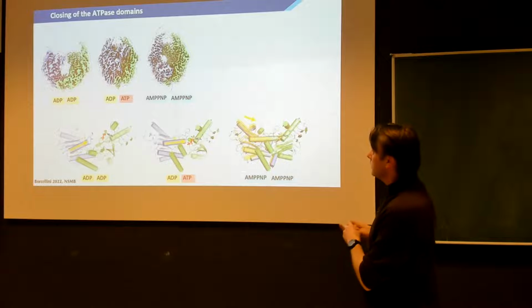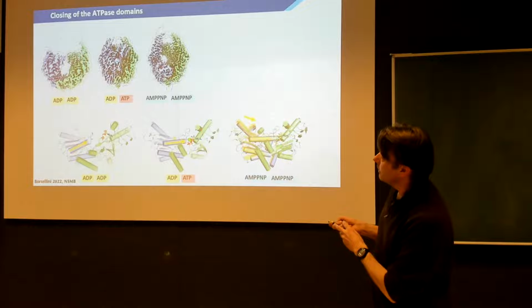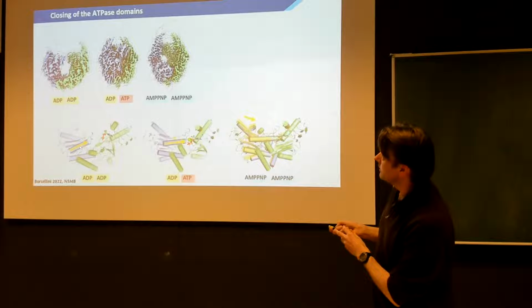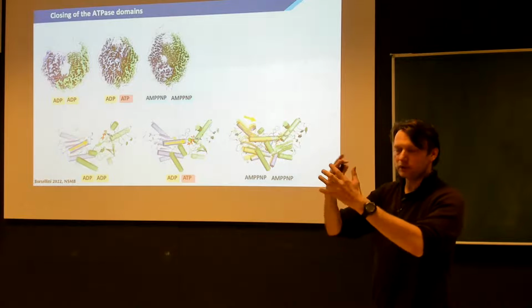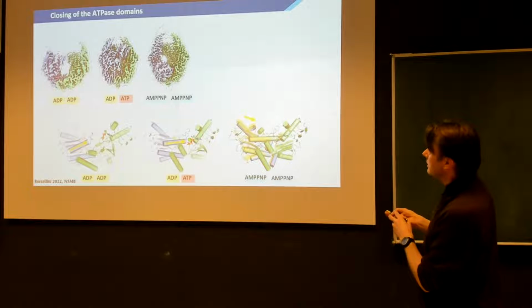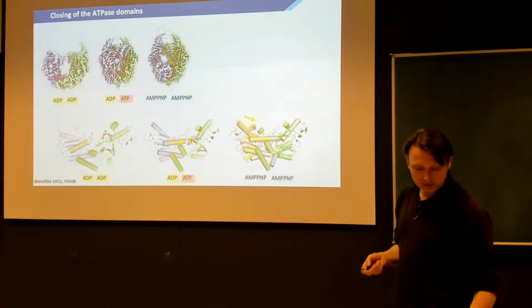So when we first look at the ATPase sites and see what's going on, upon binding or exchange of ADP to ATP, you see that this helix is moving towards the phosphate tail of the ATP, and it's really putting the two things together. Then in addition of the second ATP site, you get an even further closing of the active site, which then allows it to hydrolyze ATP.